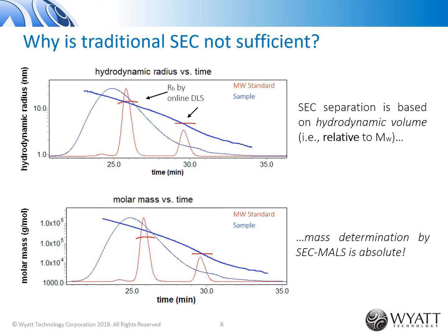These are highly charged molecules that don't have the same conformation or the same density as, say, a protein molar mass standard. And so having a MALS detector means that you can directly measure those molar masses without worrying about not having an appropriate standard for your molecule.